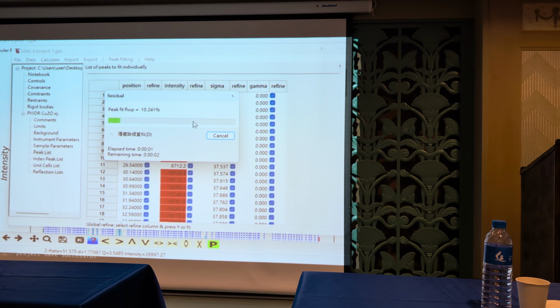And in this mode, I think for the simple structure it would be easier. But if you want to look for a very complicated compound, that would be very, very difficult. So sometimes we will start from some isostructure and iso compound.